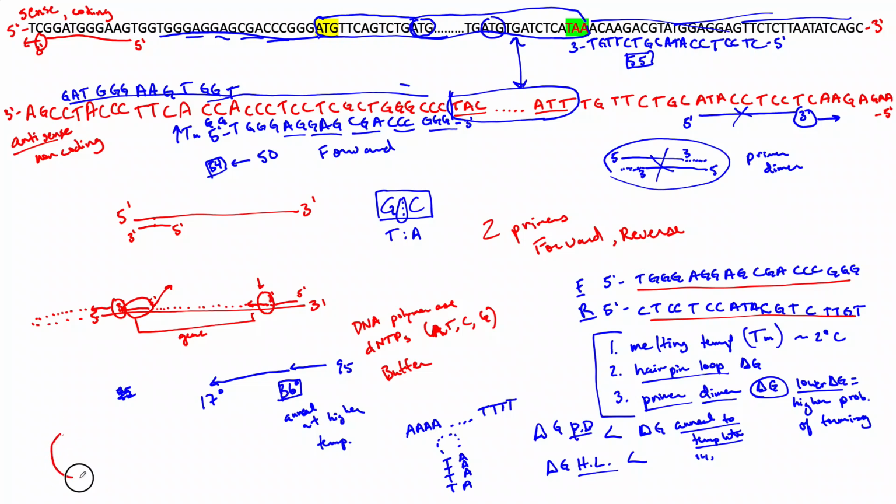Remember, we said that when we have a donor plasmid that has the gene we're interested in cloning, and there are no cut sites that match the cut sites that we find in the MCS of our receiving vector, then what we have to do is do PCR, where we add cut sites to our primers. And so what we're going to do now is add cut sites to our forward and reverse primers that are compatible with the cut sites that we find in the multiple cloning site.